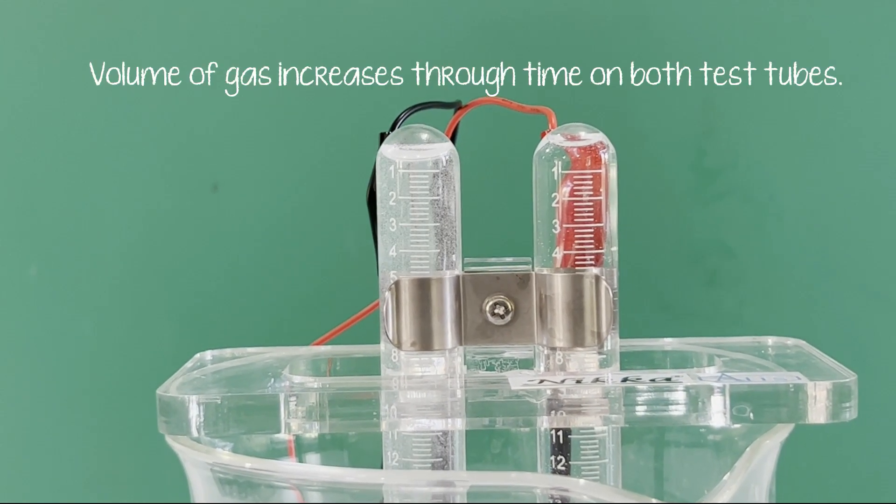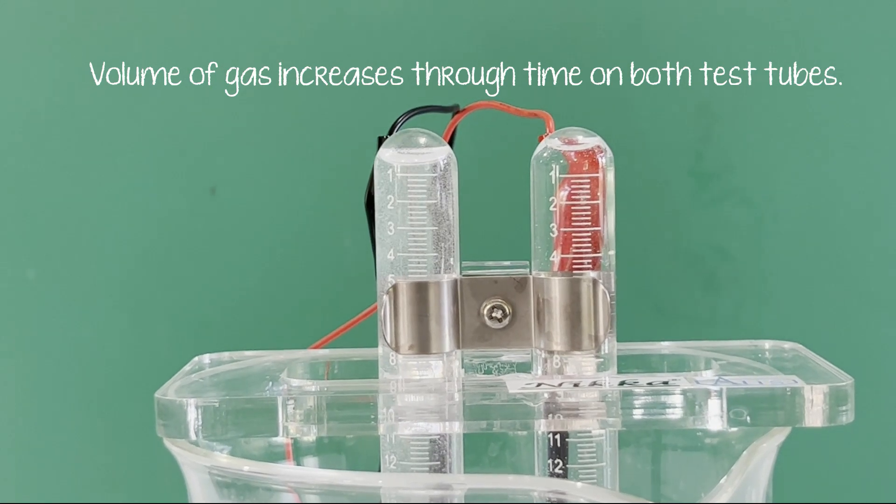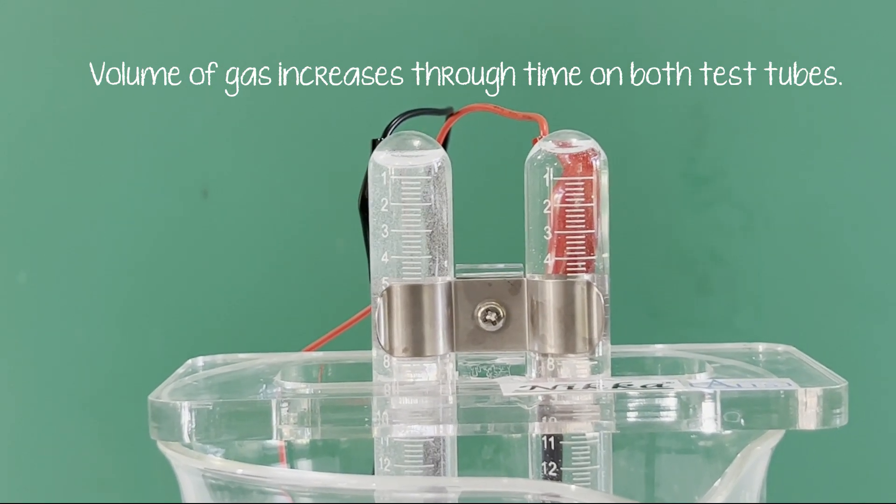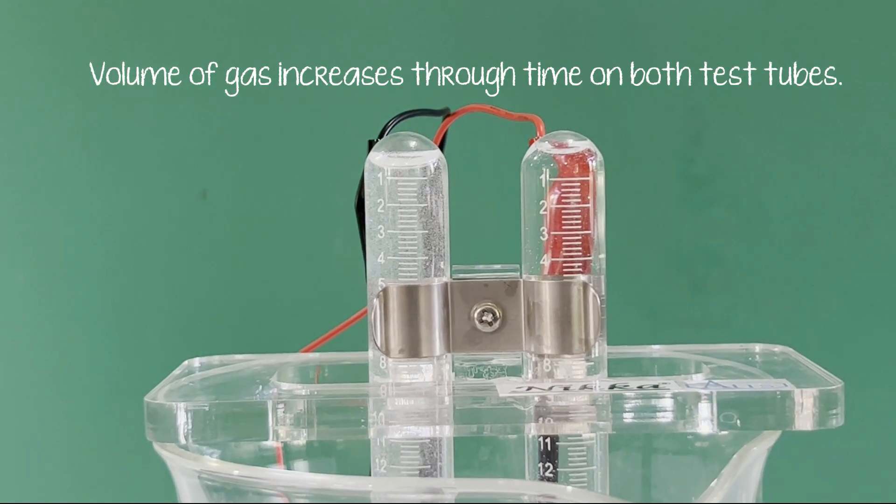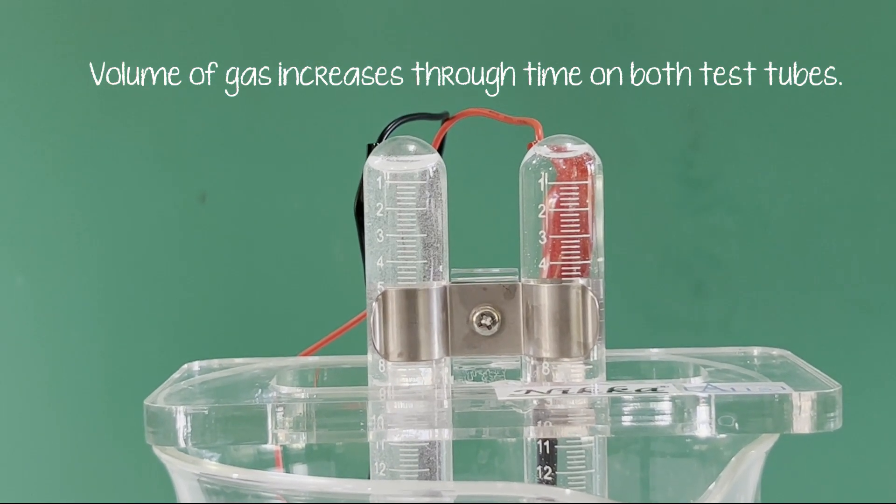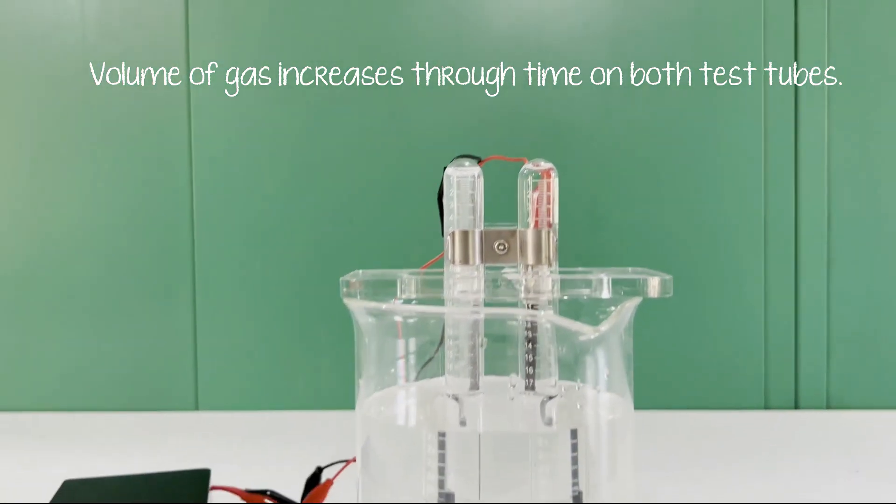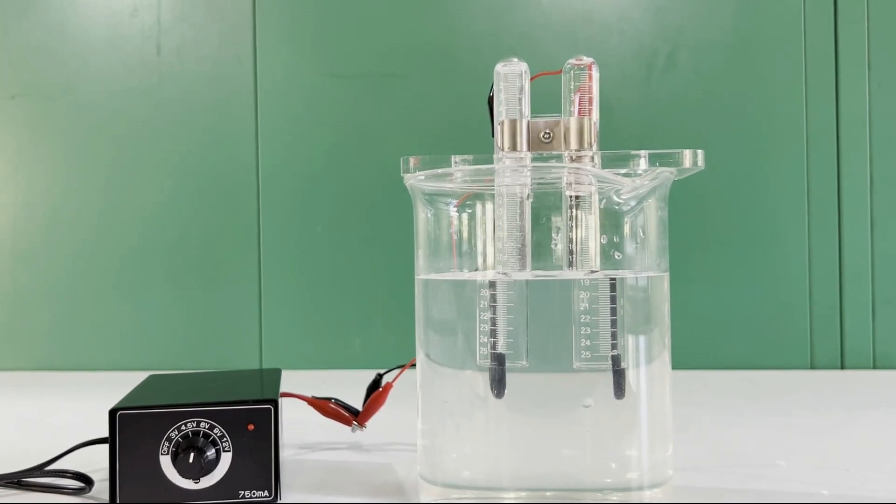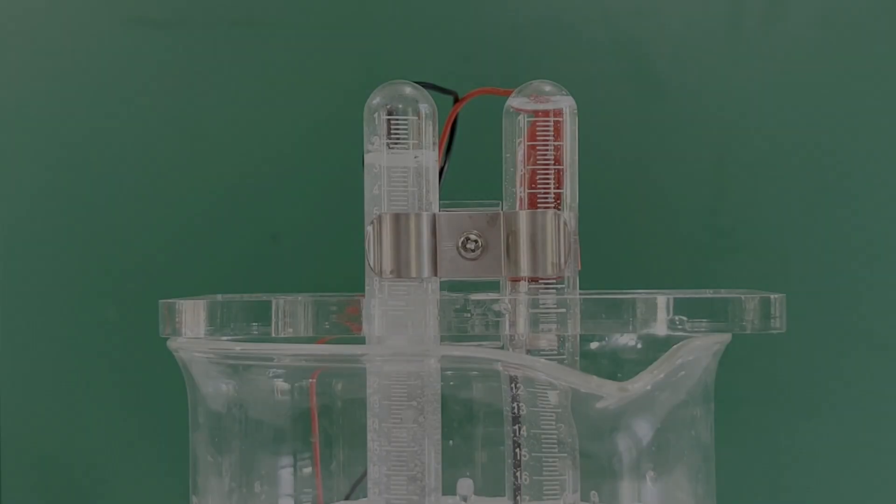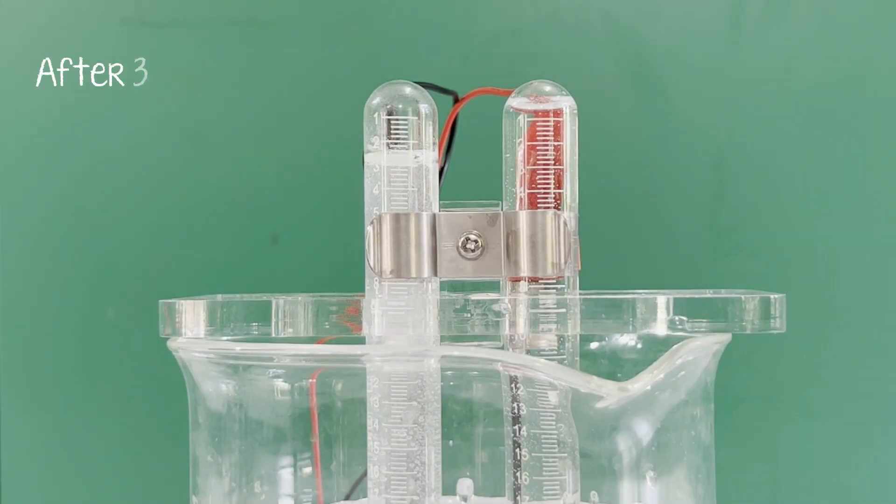The volume of gas increases through time on both test tubes. Here we have the setup after 30 minutes and we can see that there is now a significant change in the volume of gas on the left side connected to the cathode.